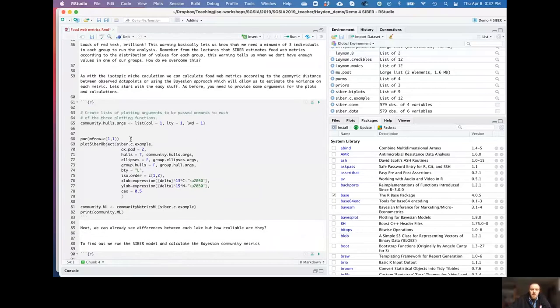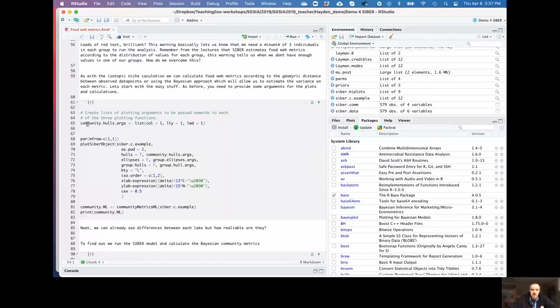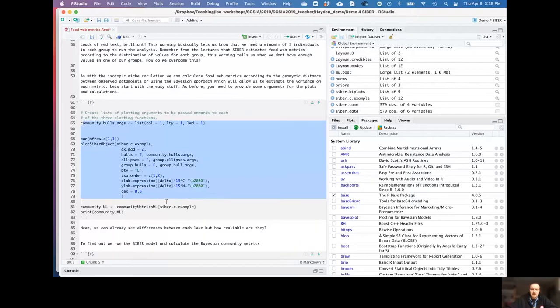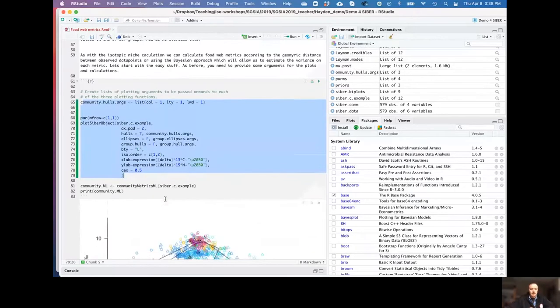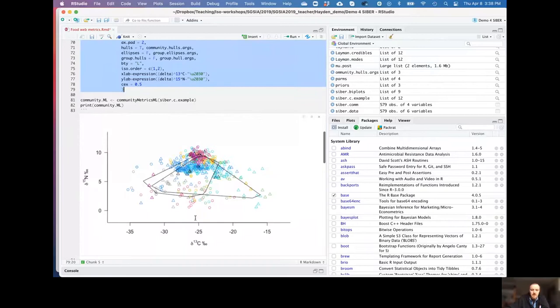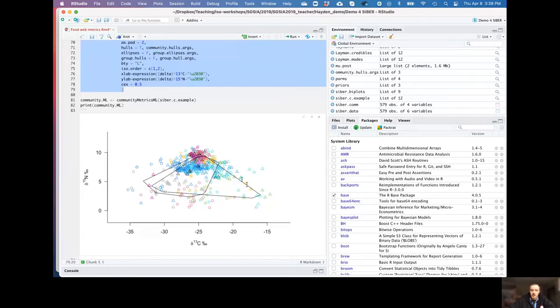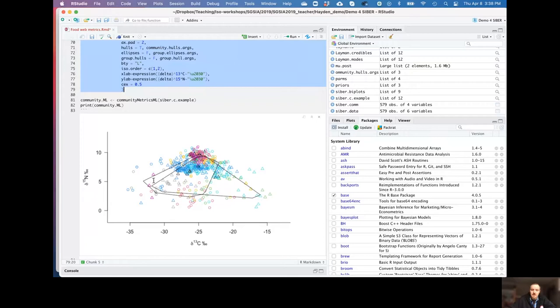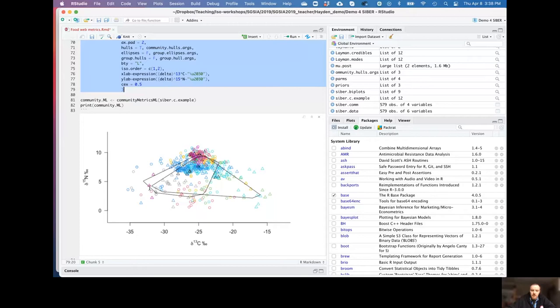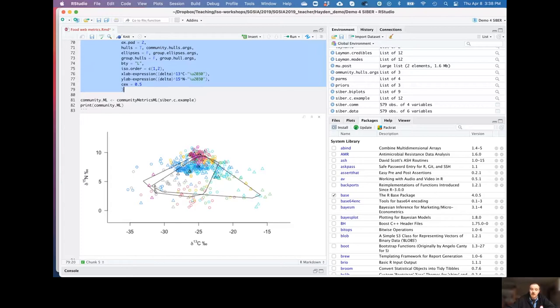So we need to run this. So we do the basic version first and then we move on and do the Bayesian version, the same thing that we did last time. Okay, so we can put all this in and press go and essentially what we're going to do first of all is generate those plots similar to last time and then get the community metrics together first. So here's our figures. Here's our first plot. And essentially what you'll see here is that we've overlaid the two lakes, one over the other, and we're looking at these hulls here.